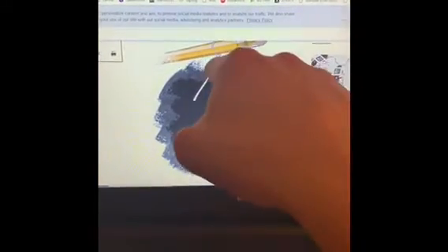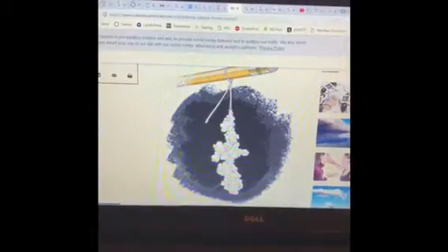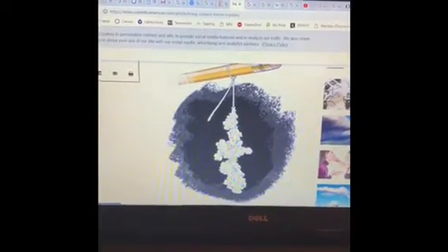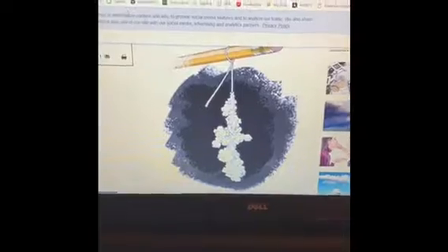Another way to form crystals of a different material comes from Scientific American, and they tell how to make a borax crystal, but to make it on a string, which is how it differs from how we did it. So what you do, you start similarly. You use store-bought borax and make a saturated solution of that, and then you either cool it in an ice bath or you allow the solvent to evaporate slowly off.